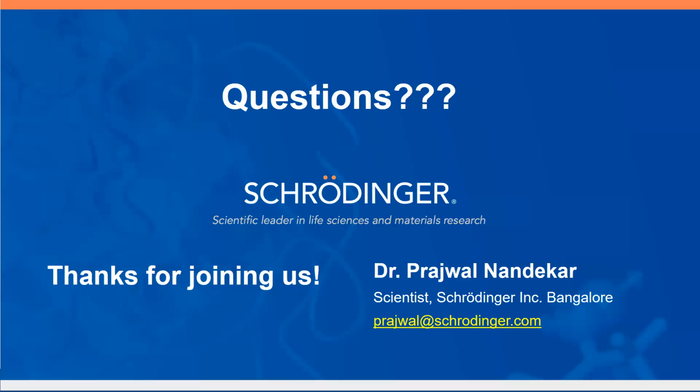Thank you. The next question is, why do we have to use other tools if everything can be performed through Ligand Designer? Ligand Designer is the advanced tool which basically does ligand design. The aim of Ligand Designer is to integrate all those tools into it. Before that, you had all those separate tools present in Schrodinger, and they are still present separately. But Ligand Designer is something advanced and additional, where you have all modules integrated in one panel. So it just gives you ease of use.